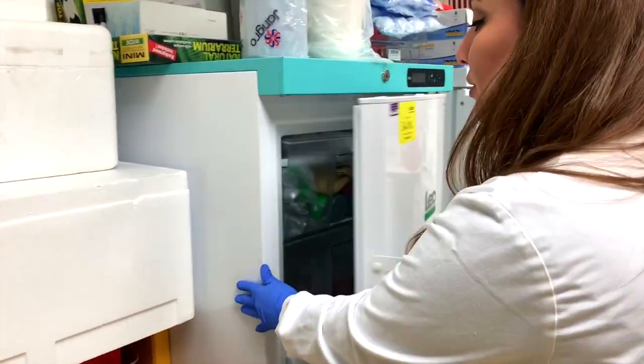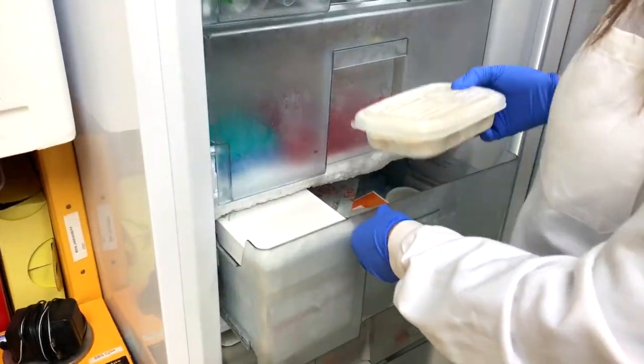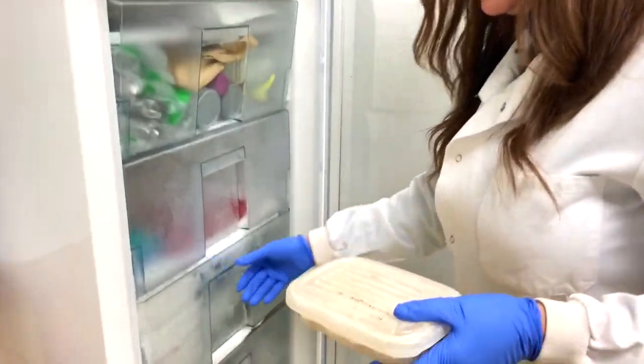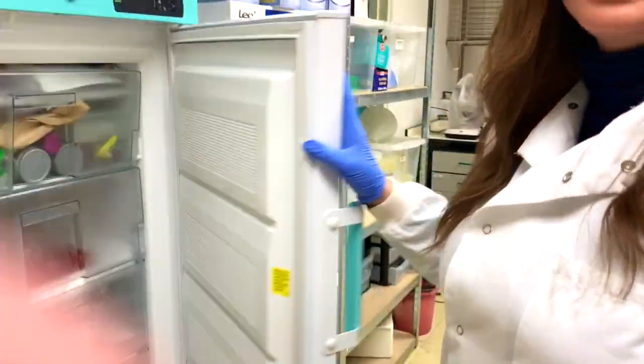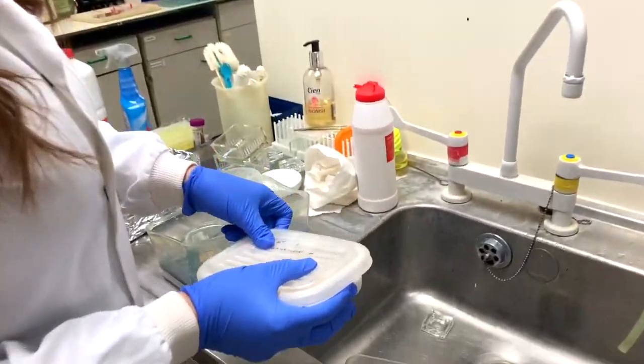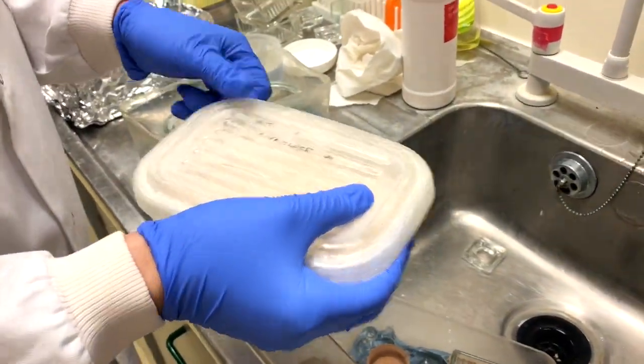The food I normally prepare is in a pan and I just keep it in the freezer. And what is the food? The food is a mixture of whole grain, flour, yeast, and grape flour. And yeah, just prepare it like that.